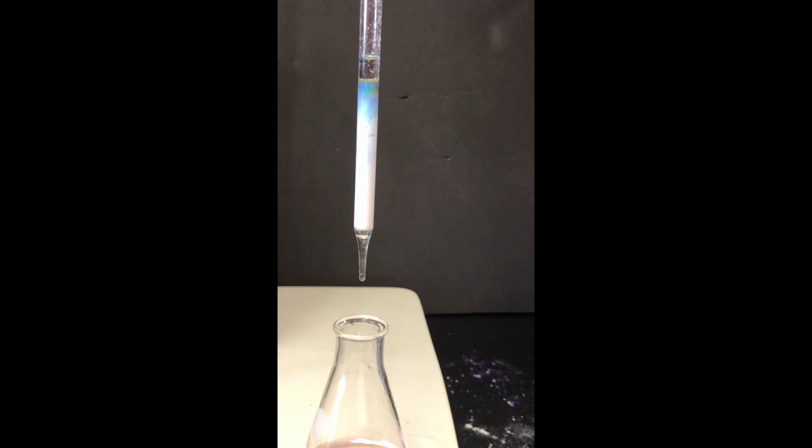So again, you can see the packing in this. This is very satisfying. It's a glass tube, and you can see that white silica normal phase packing. But you can't apply much pressure to this. If we applied high pressures to this glass, it would just explode. So those steel tubes are the same idea as this. You just can't see the column packing inside. You can't see that slurry of beads because you have to have it in a steel tube that can withstand high pressures.